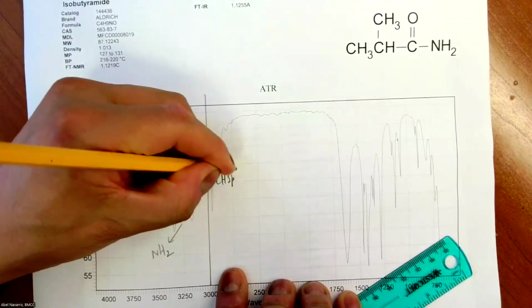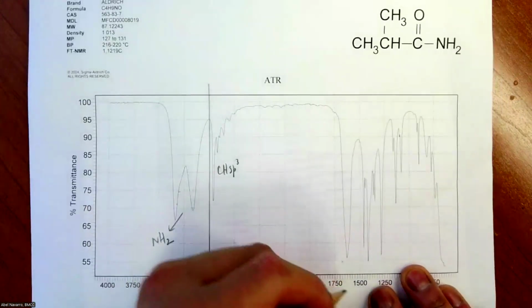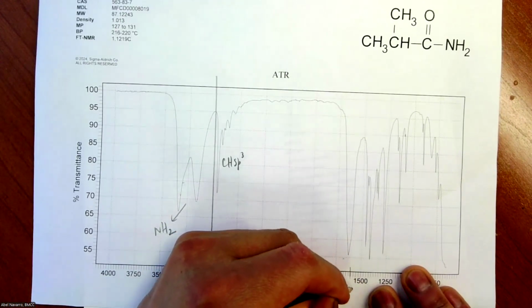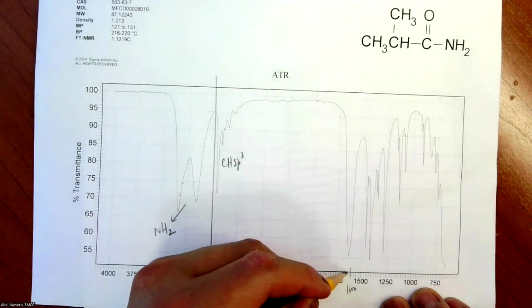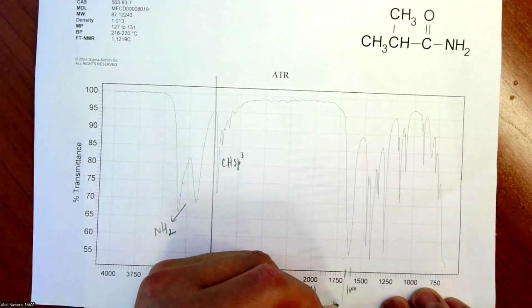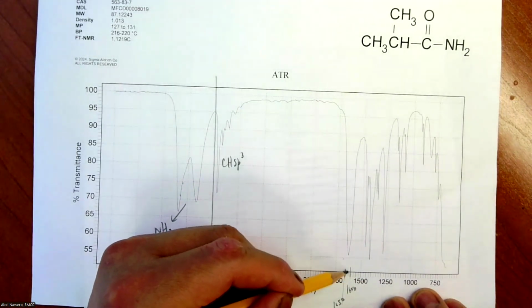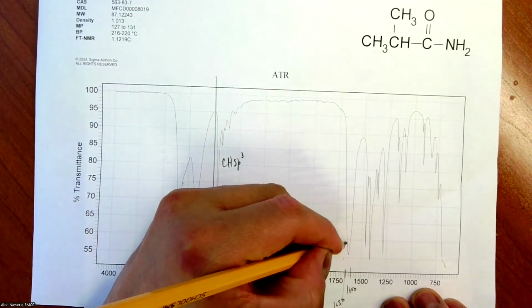CH sp3. Well, I see the C double O right here, and that's actually a little bit lower, between 1650 and 1625, more or less, around 1630.